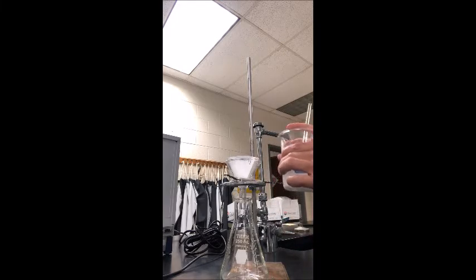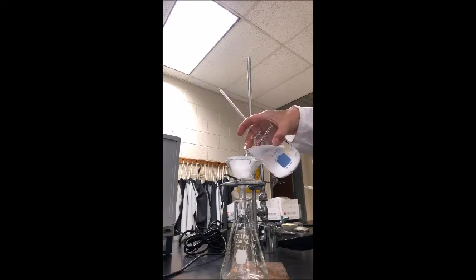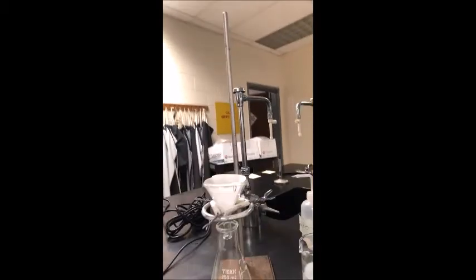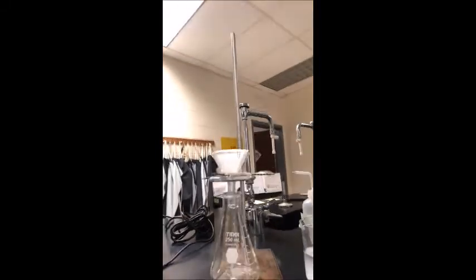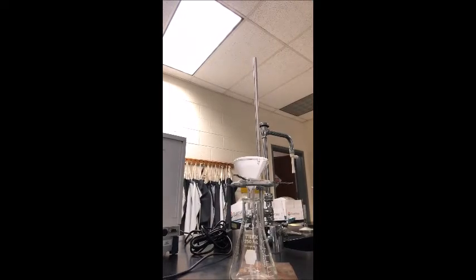Now when you filter, you don't want it to go above the filter paper in the funnel, but you'll see here, so I'm pouring it in, I'm almost to the top of the filter paper, and now it's coming out pretty fast. It should, because it's liquid, but as you can see at the top of the filter paper here, you don't want the liquid to go above it. So that's what I'm going to keep doing, is I'm going to keep adding more to the funnel as it clears through, as it starts to go down.